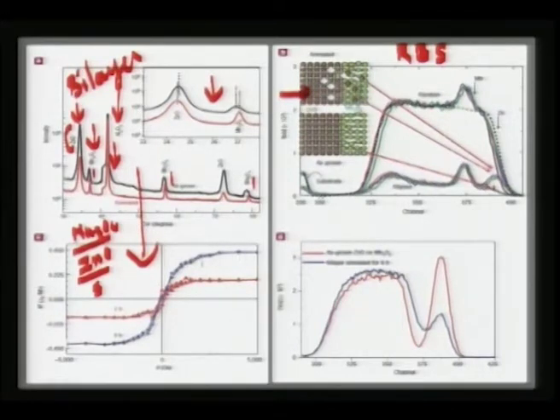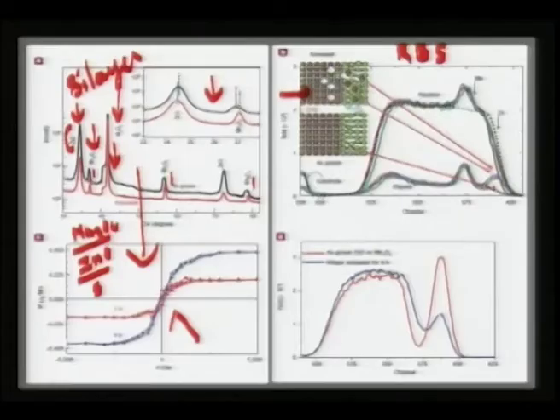Incidentally, this signature is comparable to what is reported. So, instead of a reverse process, that is manganese getting doped into zinc oxide, we seem to see zinc getting dispersed into the Mn3O4 matrix, forming a secondary phase which is responsible for such a magnetic phase.